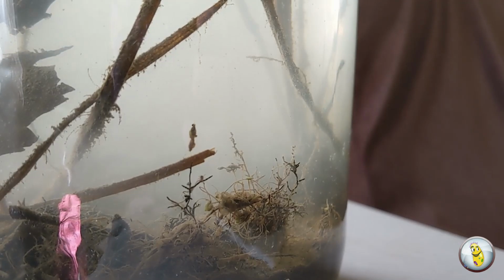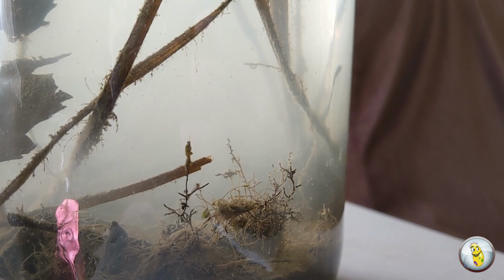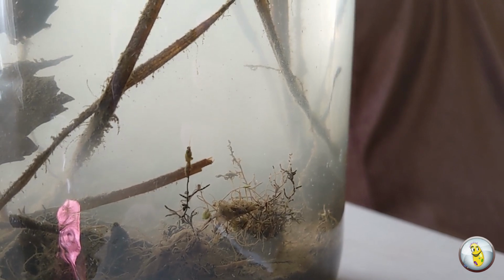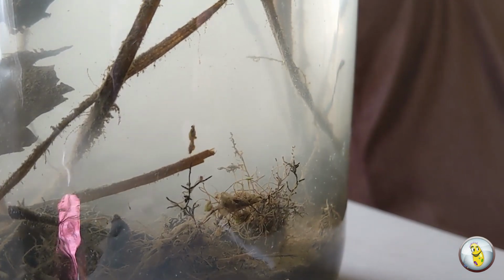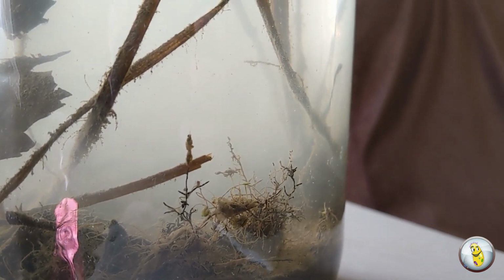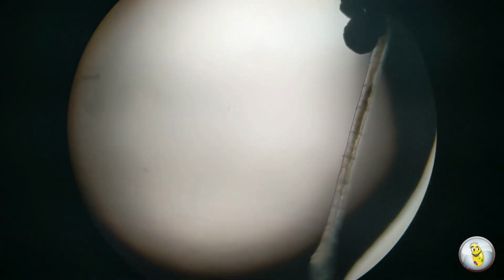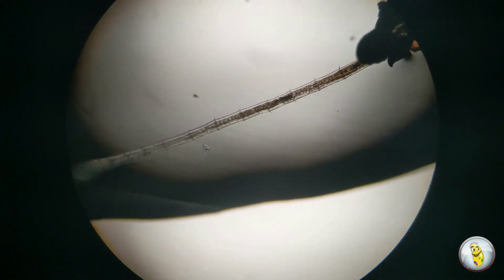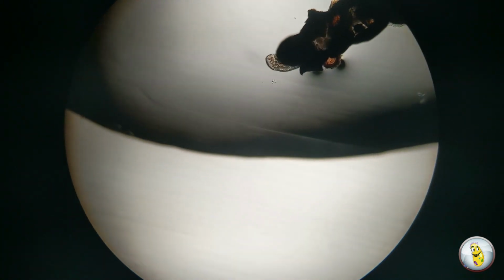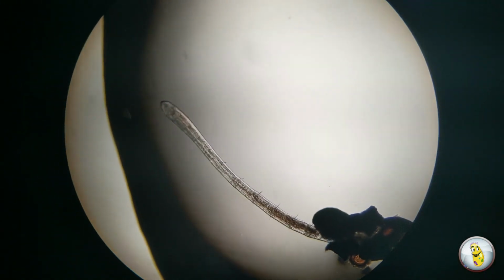That is until yesterday, when I looked at one of my sample jars, and I saw another of these creatures bobbing up and down slowly on the side of the jar. Quickly, I extracted the creature and put it on a microscope slide. I slid the slide onto my microscope stage, and this is what I found. Lo and behold, it wasn't a silk or filament at all. It was a worm. A worm capable of sucking its face onto a surface and pulling its mobile home-like shell around with it.